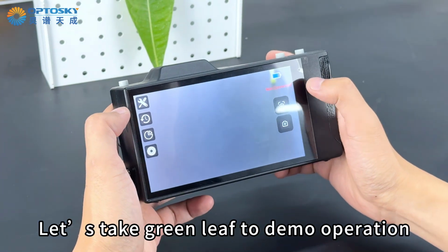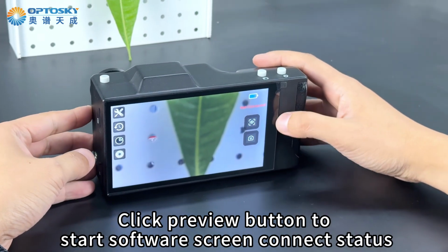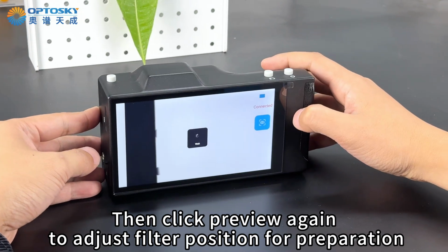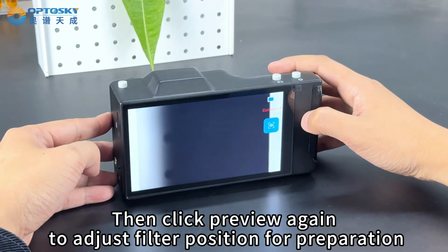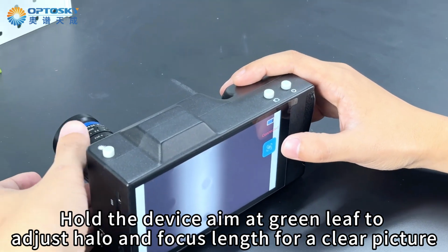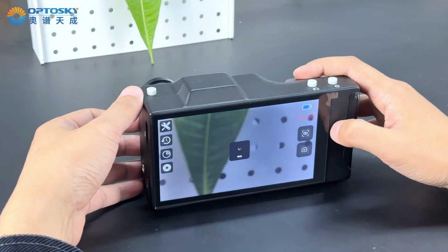Let us take a green leaf to demo the operation. Firstly, click the preview button to start the software screen and connect status. Then click preview again to adjust the filter position for preparation. Hold the device aimed at the green leaf to adjust the halo and focal length for a clear picture. Click preview again to return to the default.